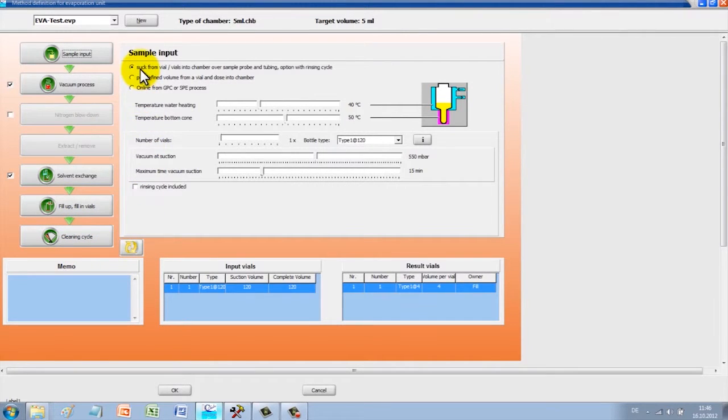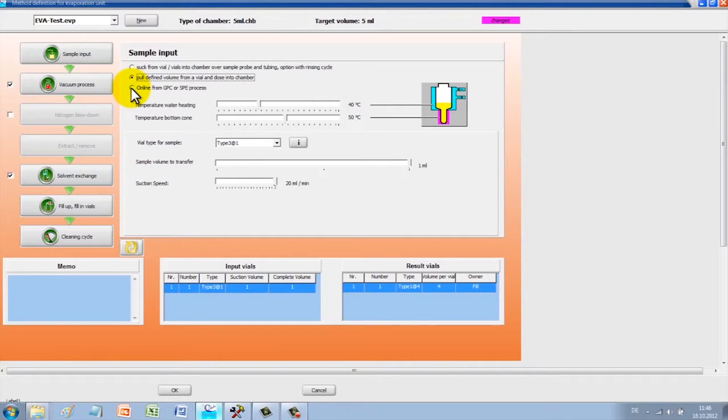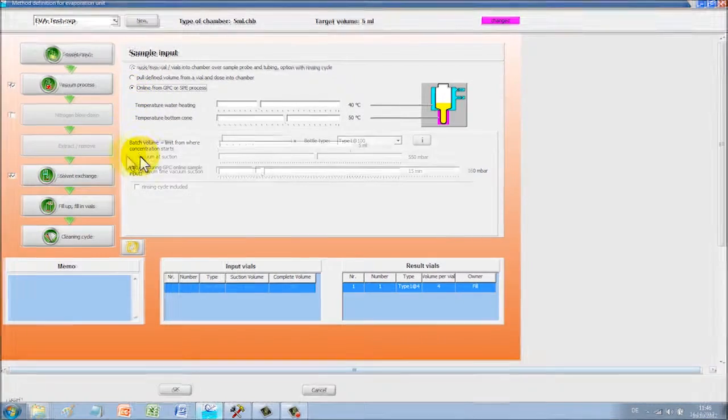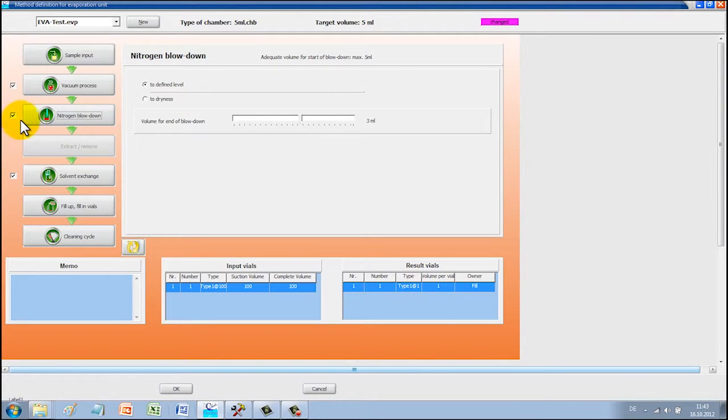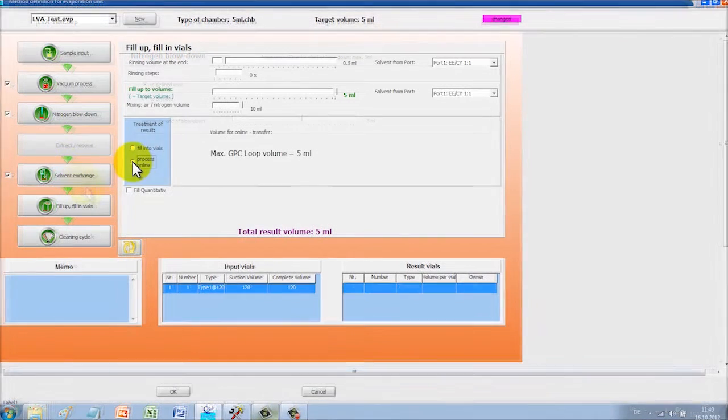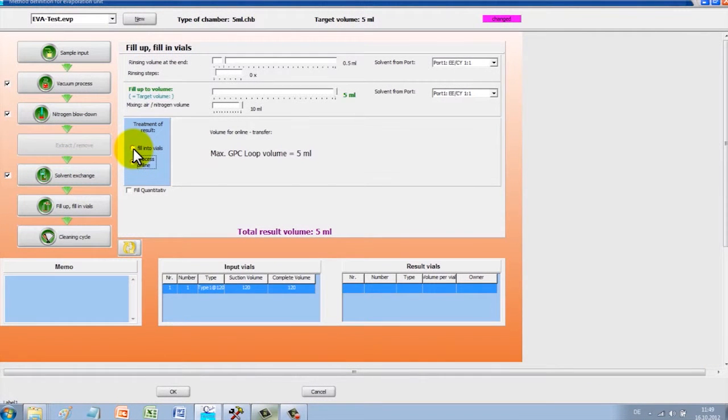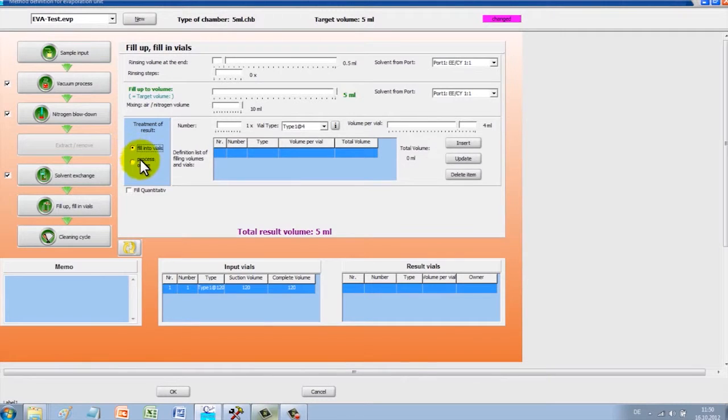Where does the sample come from? Three different options can be selected. The desired evaporation technique, for example vacuum or blowing off with nitrogen, can be selected individually or combined. Where is the sample to go? Here glasses and filling volumes can be freely defined.